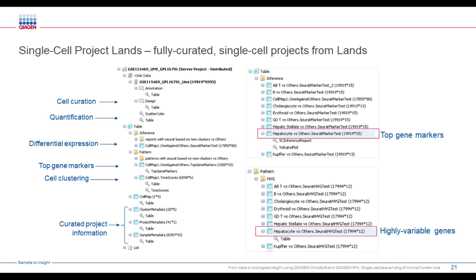And we can also, using the same Seurat, detect the highly variable genes between the clusters. So from that step here, from which you have downloaded from the single cell Land project, to your own customized analysis, if you wish, it's extremely simple because you rely on the cluster cell type that has been predefined previously.